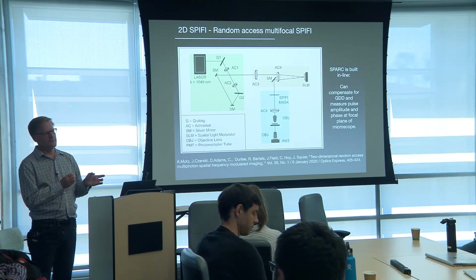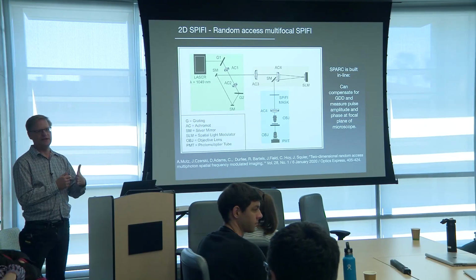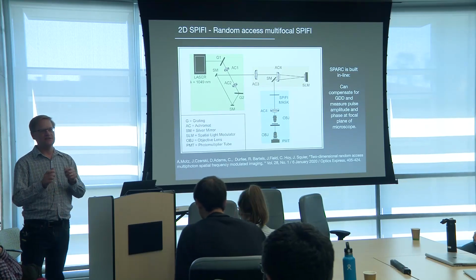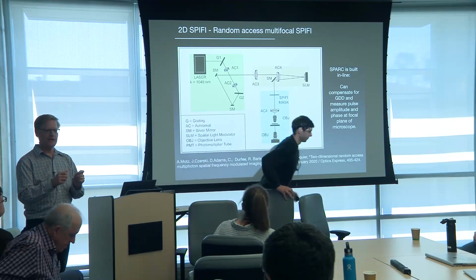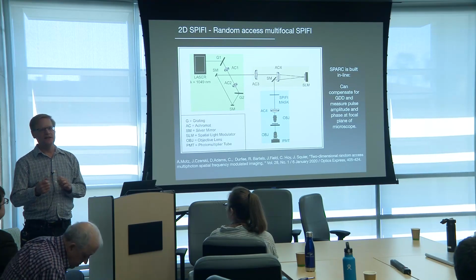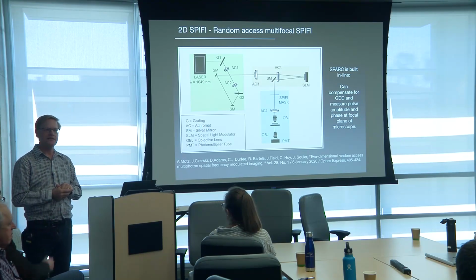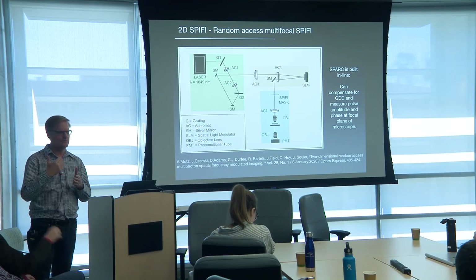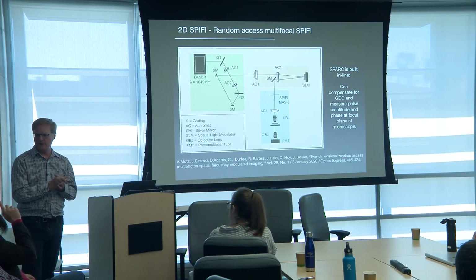My senior design students have had a lot of fun with that, especially on the video rate system. They tried to look at it themselves, but we haven't done it systematically and quantitatively. They literally take 2 layers of Thorlabs lens tissue and put it on the incoming beam, and then 2 layers on the collection side. With the camera you can see nothing, of course, and then SPIFFI is picking it out fine. That's linear imaging. But I'd like to build up systematic models that would be acceptable to this community to really measure that.